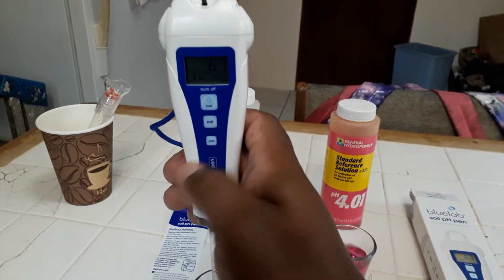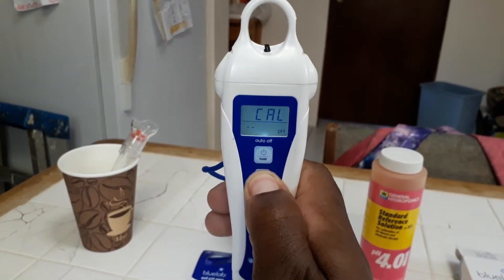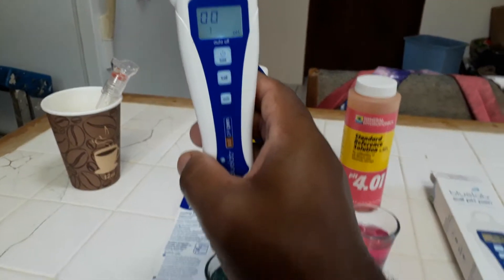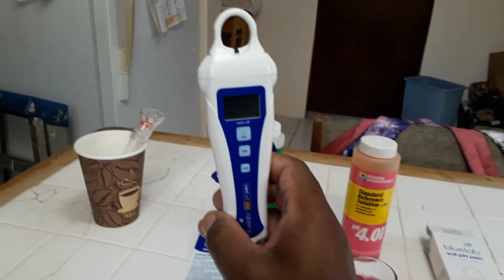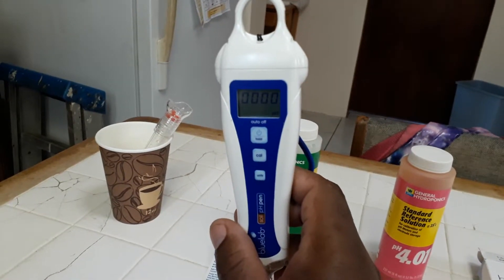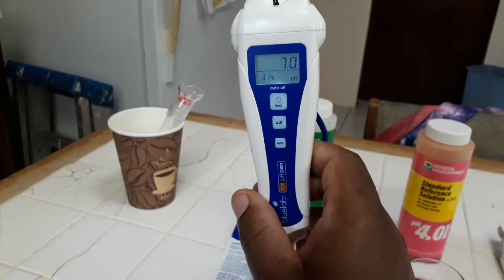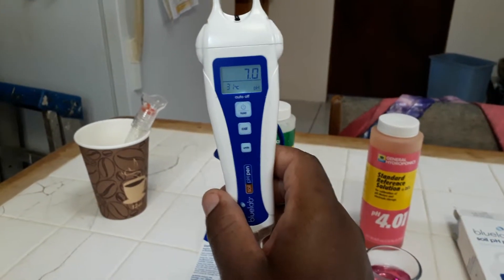It doesn't seem to be moving from 6.7, so I'm going to hit the calibration button. You just push the button and it will start flashing, then it picks up the solution and calibrates itself. You know it's done when it stops flashing. It's still calibrating and should show 7.0 — and it's finished. It is now calibrated to 7.0.